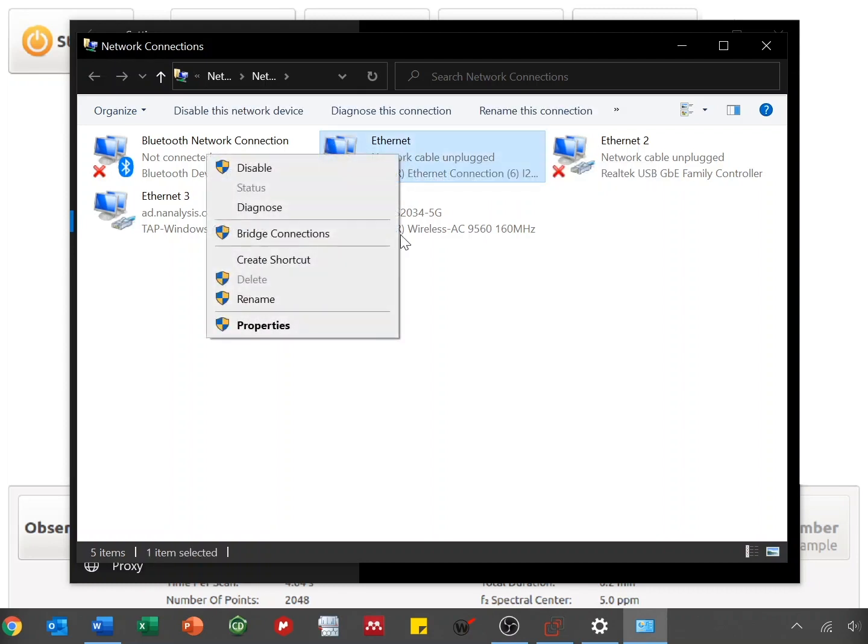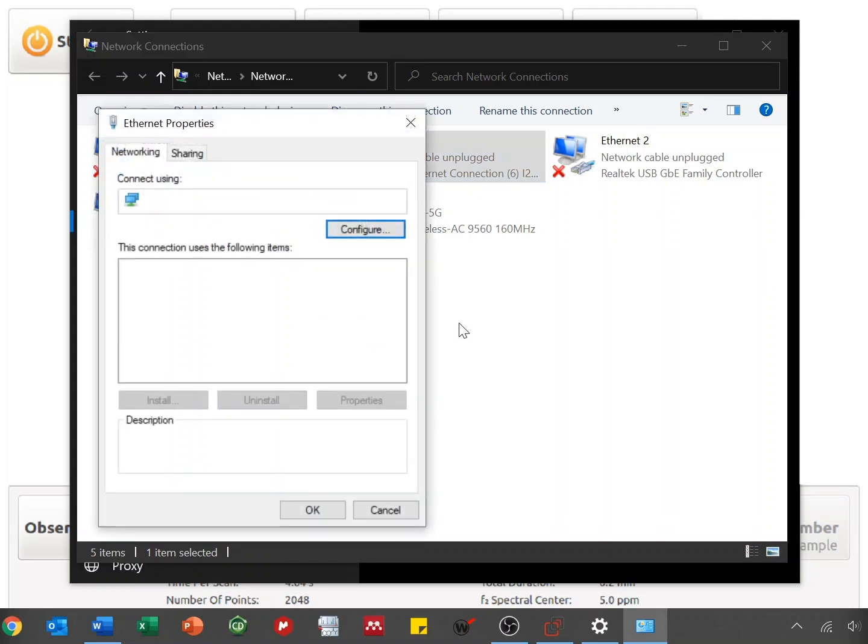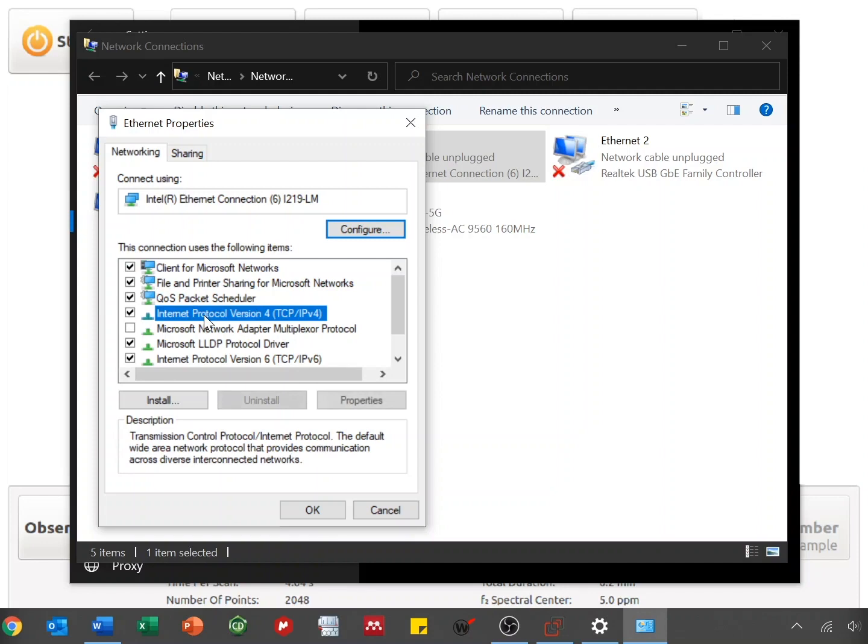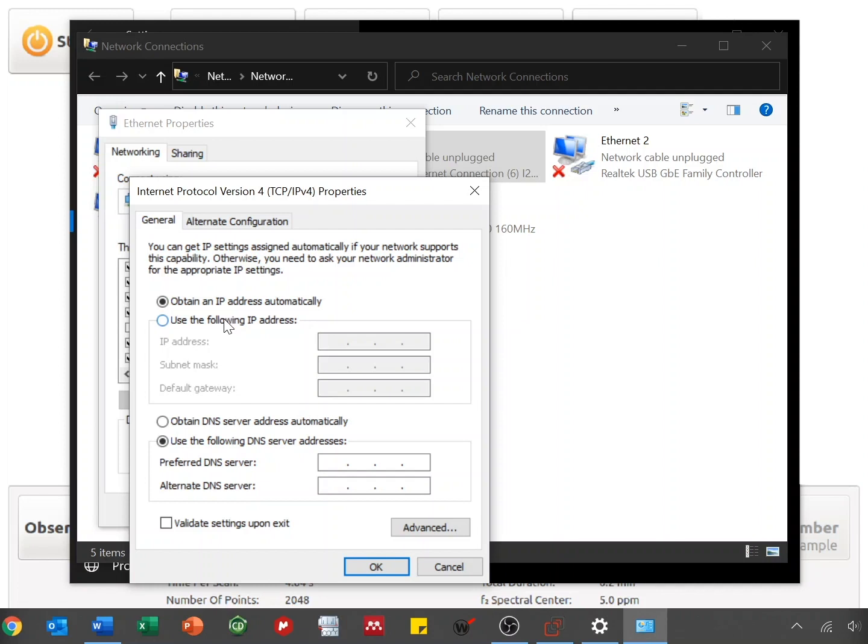So right-click Properties, select Internet Protocol Version 4 or IPv4, and then click on Properties. If there's an existing IP address here, please write it down in case you need it later. For now, we're going to click on Use the following IP address.